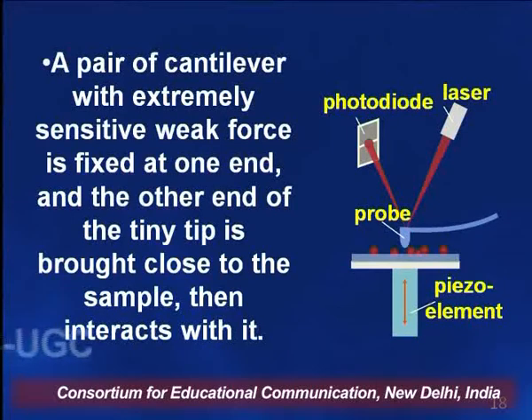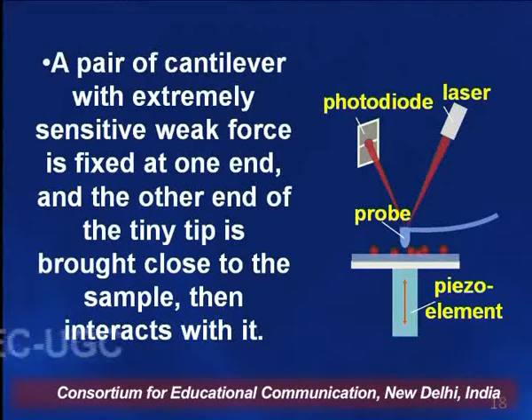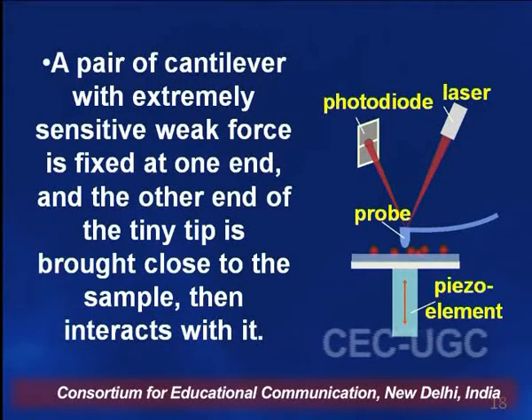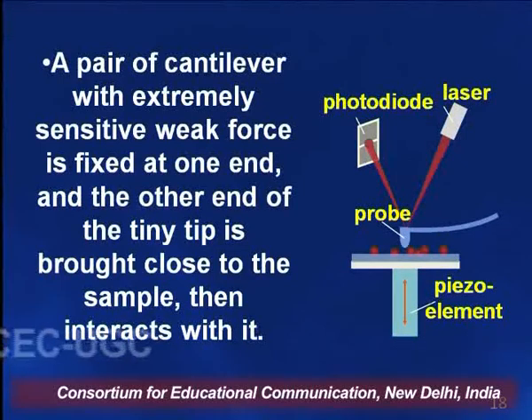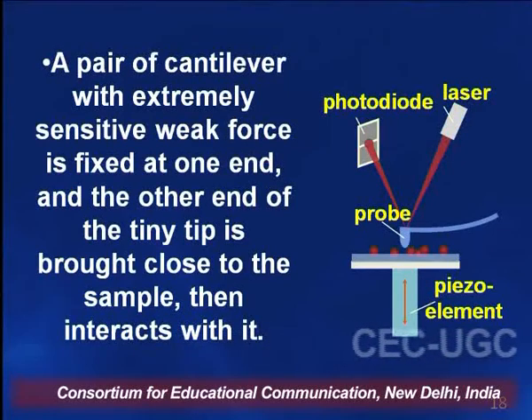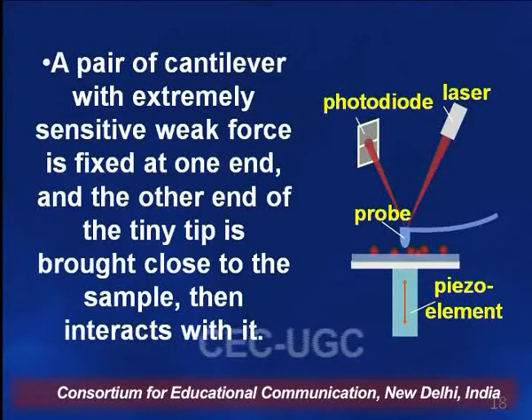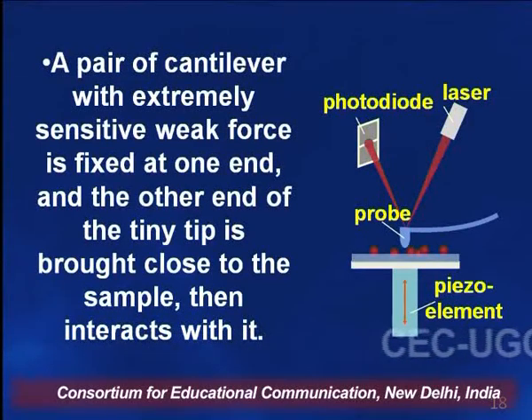A cantilever that is extremely sensitive to weak force is fixed at one end, and at the other end a tiny tip is brought close to the sample, then interacts with it. It means we are exerting a very weak force on the probe, and because of this weak force, the probe moves towards the sample, and there is an interaction between the sample and the tip.